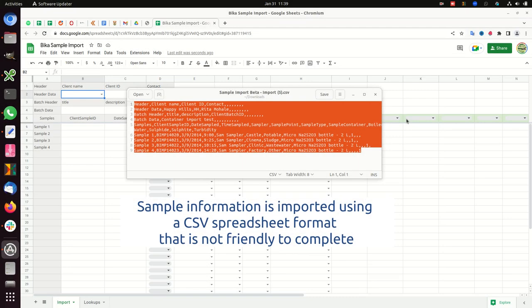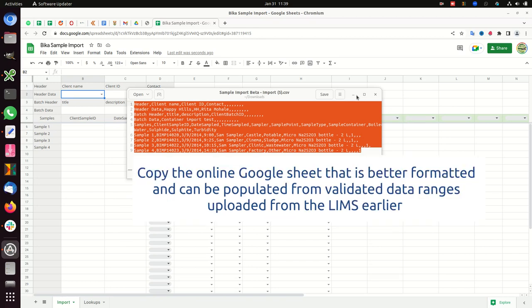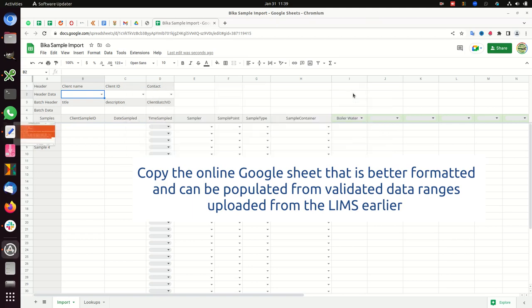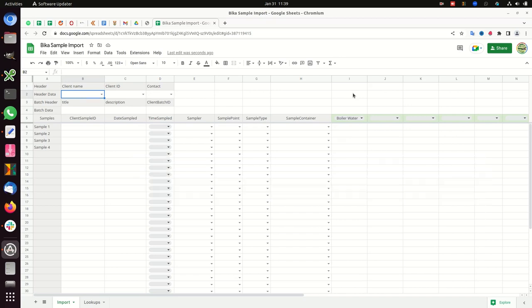Sample information is imported using a CSV spreadsheet format that is not friendly to complete. Copy the online Google Sheet that is better formatted and can be populated from validated data ranges uploaded from the LIMS earlier.